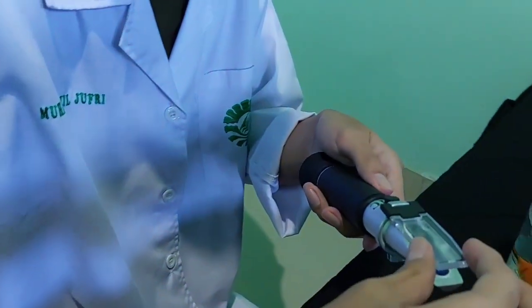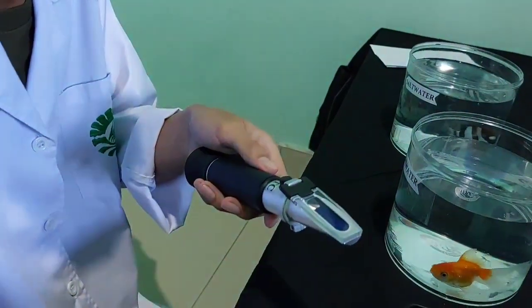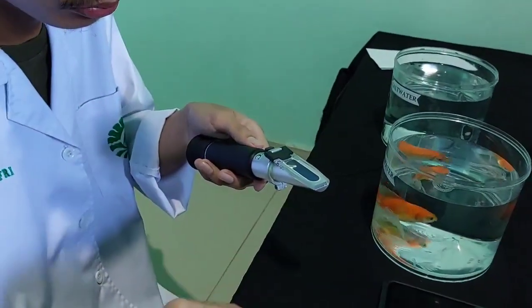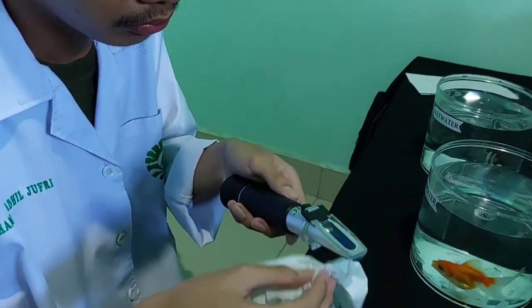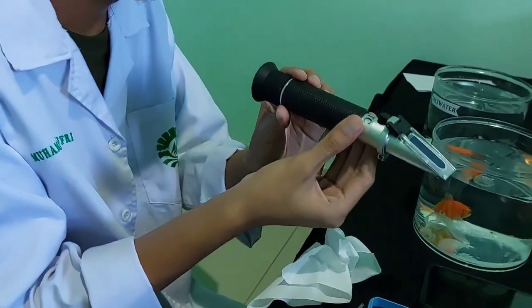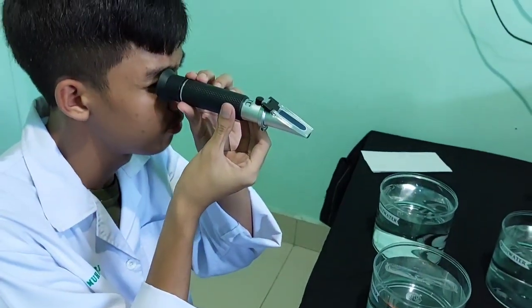Close the prism with the cover slide. Wipe off the excess water with a tissue. And then start observing.